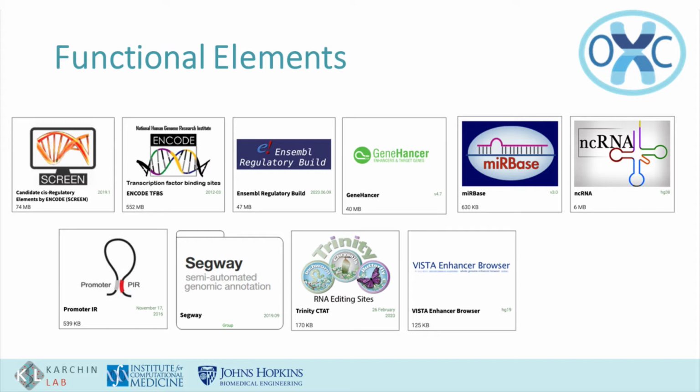While the entire catalog of functionally relevant non-coding DNA has not been fully characterized, OpenCRAVAT includes annotation sources that can be used to identify variants which occur within known functional elements in the non-coding regions of the genome. OpenCRAVAT currently includes annotators that specify the locations of promoters, enhancers, non-coding RNAs, and transcriptional binding sites.